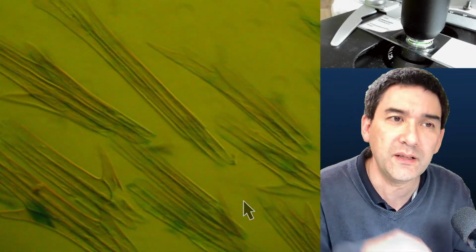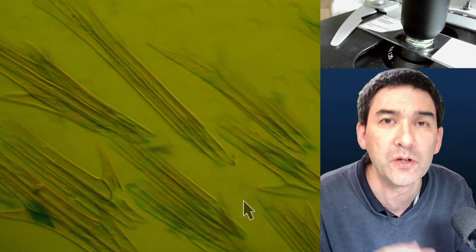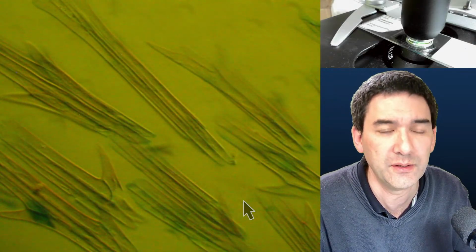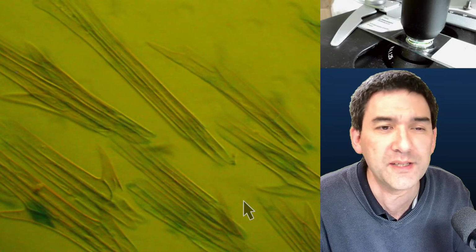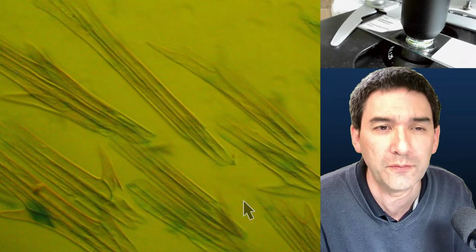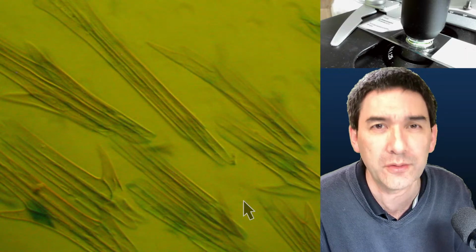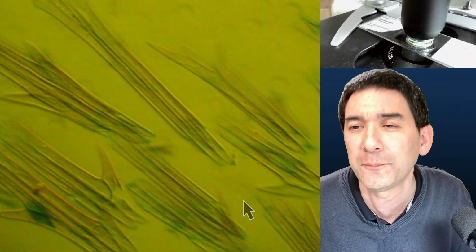Then you will see that it does look a little bit three-dimensional. This is basically called oblique illumination, when the light mostly strikes from one side. I read somewhere that back in the day, when microscopes were not able to resolve so well and the optics were not that great, they apparently used oblique illumination also to see bacteria better, because otherwise they couldn't see the bacteria quite as clearly.